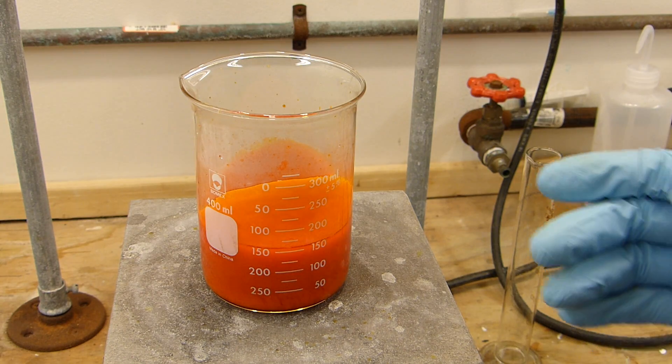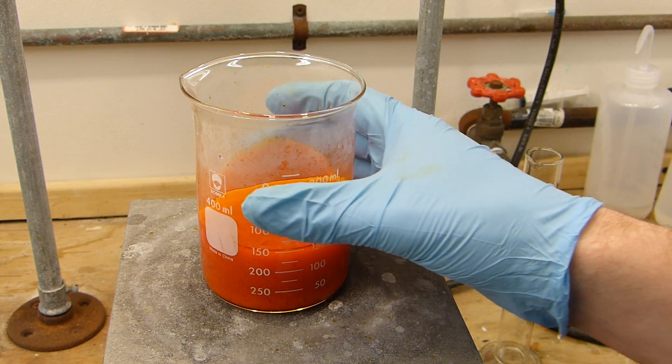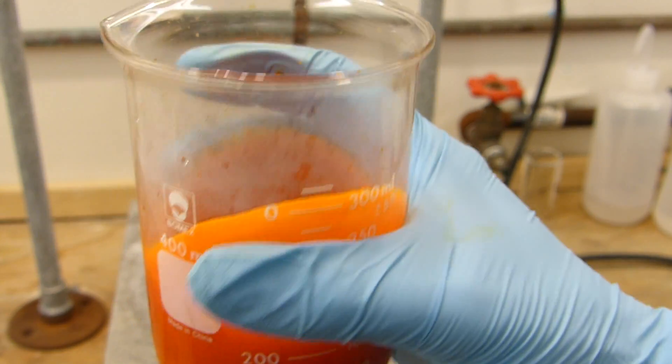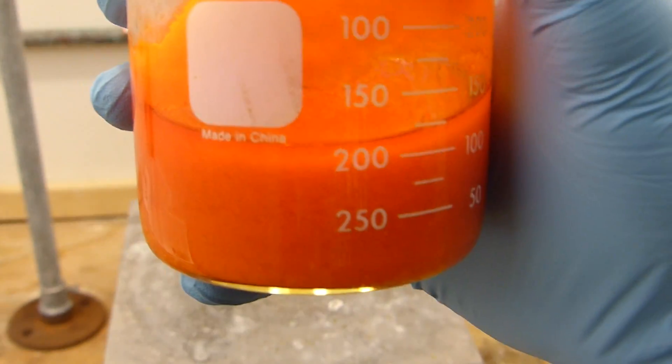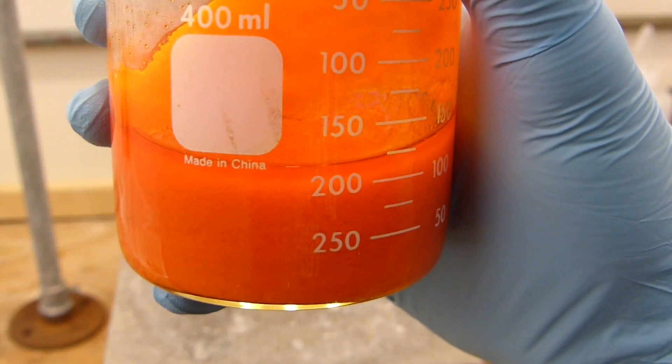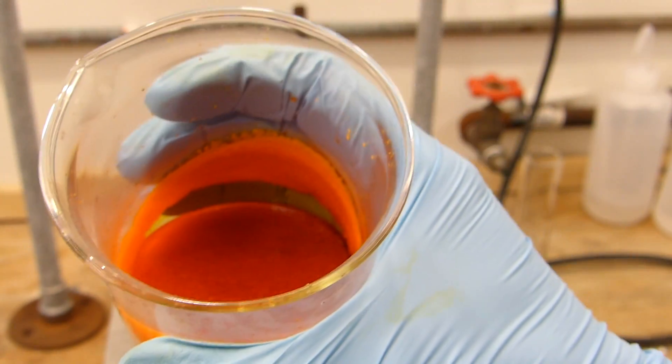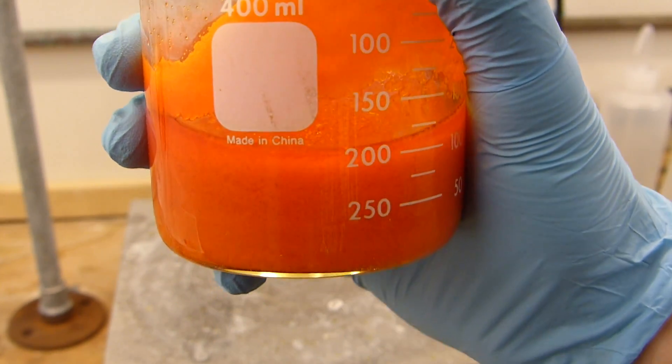All right the last of the pyridine has been added and I'm just now stopping the stirring. And you can see that we now have a bright orange voluminous sort of heavy precipitate in the beaker which is the pyridinium chlorochromate. The solution got quite warm because of the reaction, salt formation that is.